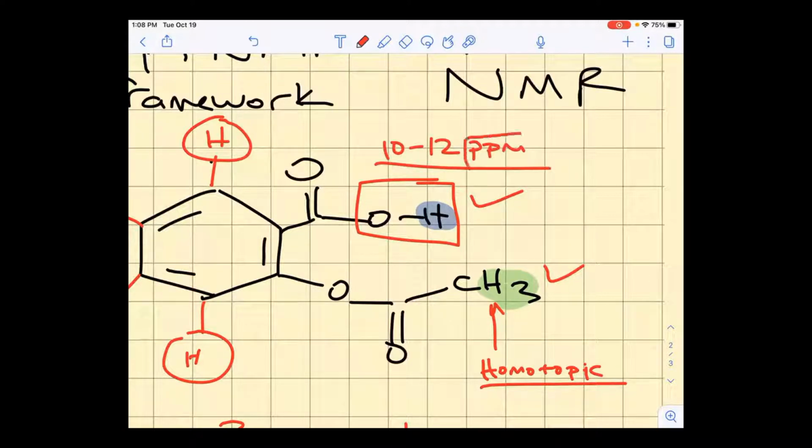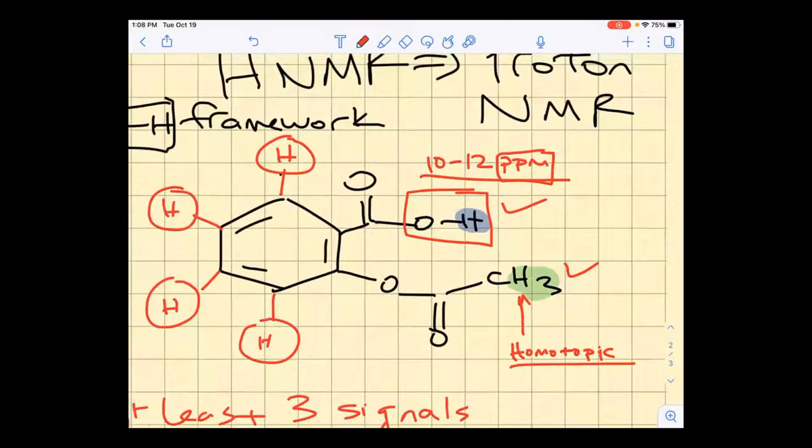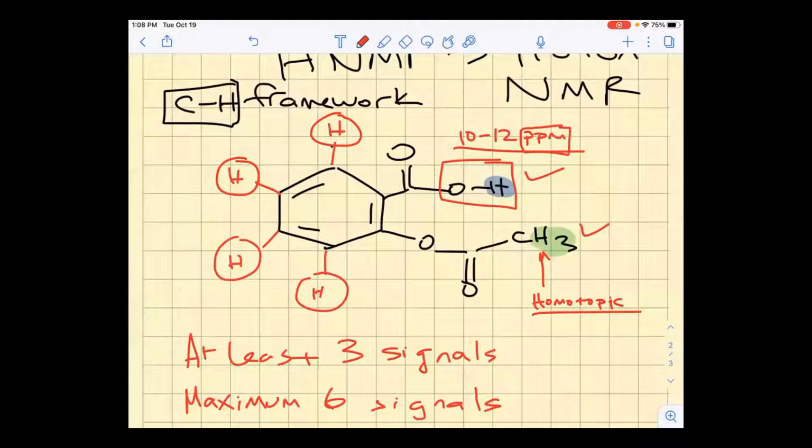So the NMR spectrum is in parts per million, and I'll explain more of this when we go down to the instrument. The scale is parts per million. It's calibrated from 0 using tetramethylsilane. And what it looks at is the different types of protons in a molecule. I'm not going to try to demonstrate the spectrum because you'll see what it looks like when we do it. So we're going to take NMRs of 3 samples, and then we're going to take an NMR of the crude sample.